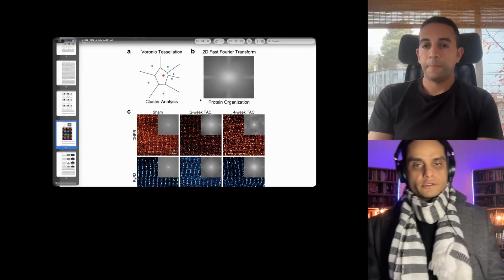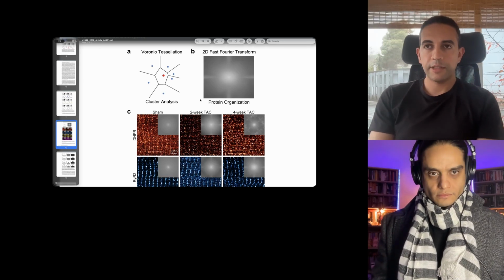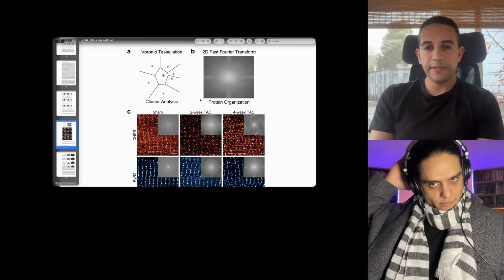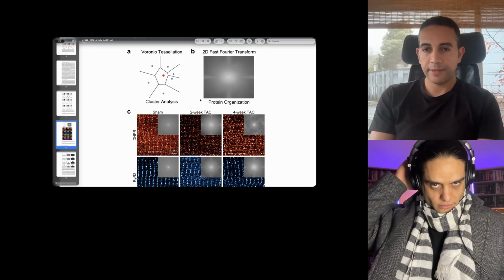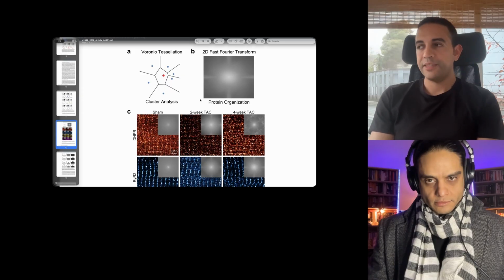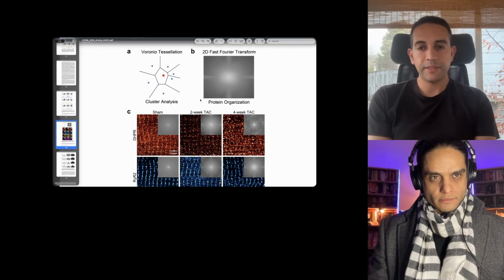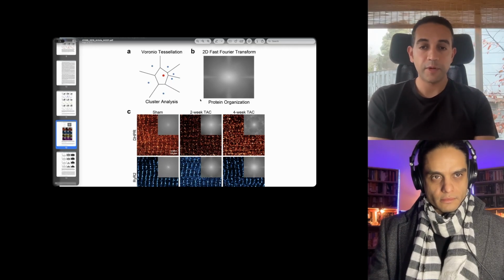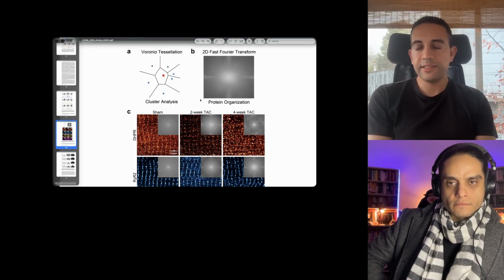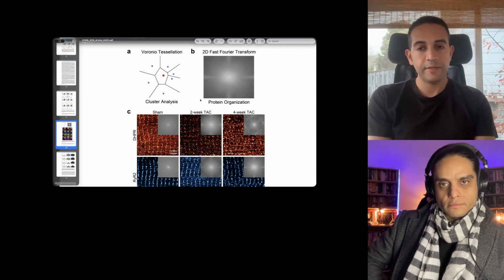Okay. How many cameras do you need? For this work, just one. For other work that we're going to talk about too. And if you want to have really good lasers, and by that I mean lasers that are going to behave, that are going to be lasing properly, that are going to be stable, that are going to be exciting within a narrow range and not something all over the place, you also are probably going to spend more money. So if you want a high-end system, it's going to be expensive. If you want a system, it doesn't necessarily need to be.